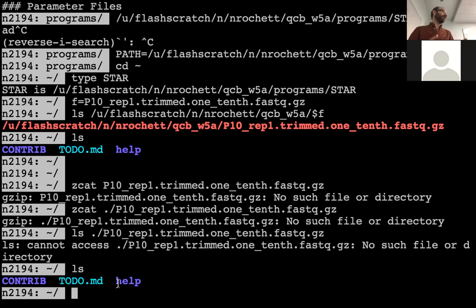The other typical issue people run into is thinking the program runs from one particular place, but then actually the program runs from somewhere else. So you can just substitute ls for the program. It's basically reducing the problem where you have this gigantic bioinformatic command that crashes for some reason linked to a file, and you replace all of that with ls to the potential source of the problem. Just ls instead of the program.